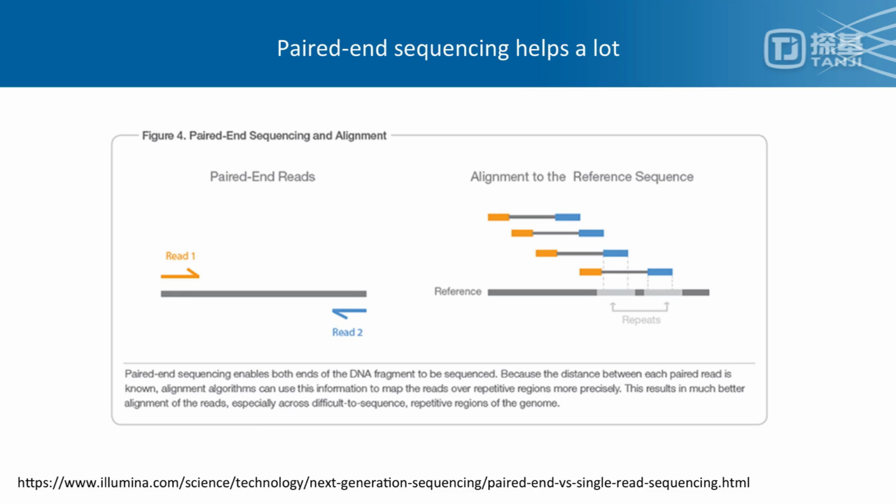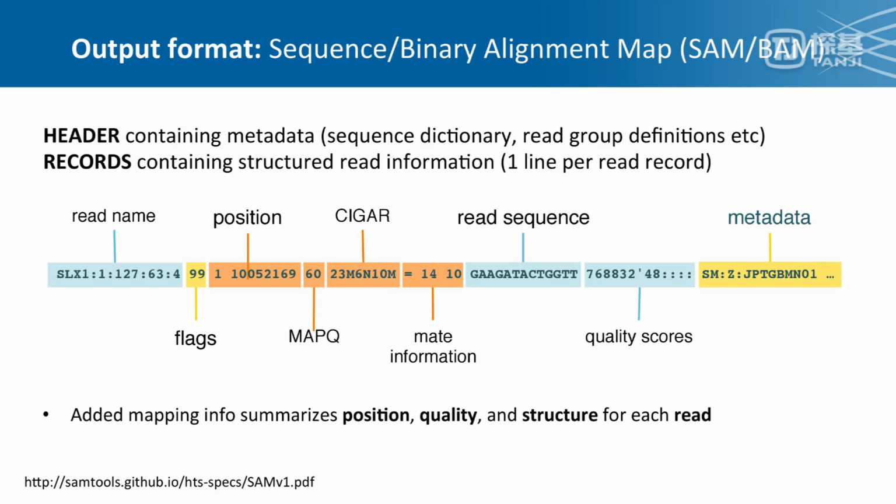One thing that helps us up front is actually what we call paired end sequencing, which is a service provided by Illumina sequencers. And really what it helps is it reads the DNA. You get two reads in opposite directions. It reads the DNA forwards and backwards. And because you know the length of your read, you have extra confidence in the read having it both directions. So you have two ends of the same sequence that effectively help you know more confidently where to map a given read.